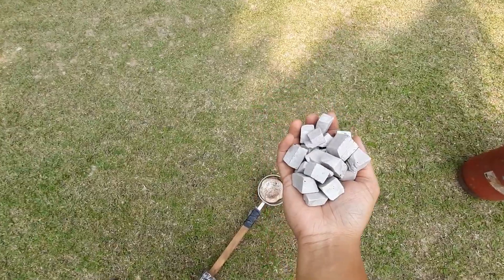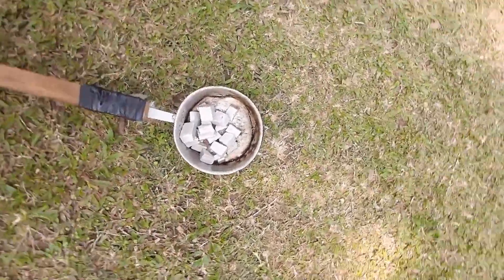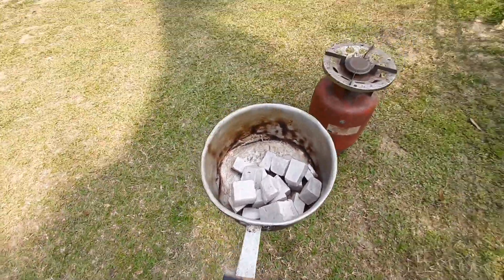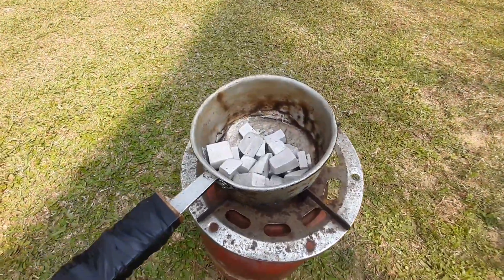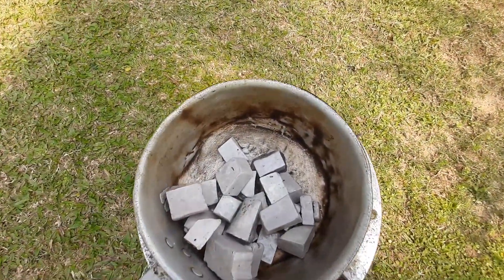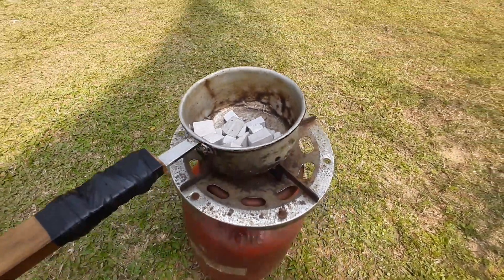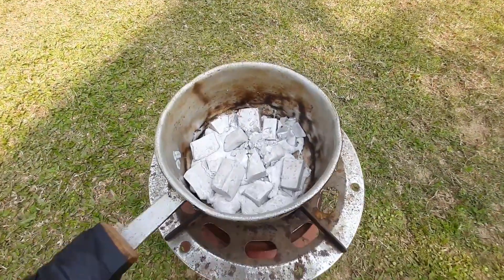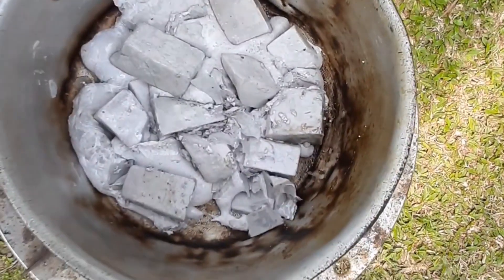But before that we will melt the sodium metal by heating on a burner for about 10 minutes. After about only 5 minutes, the sodium metal has already started to melt.